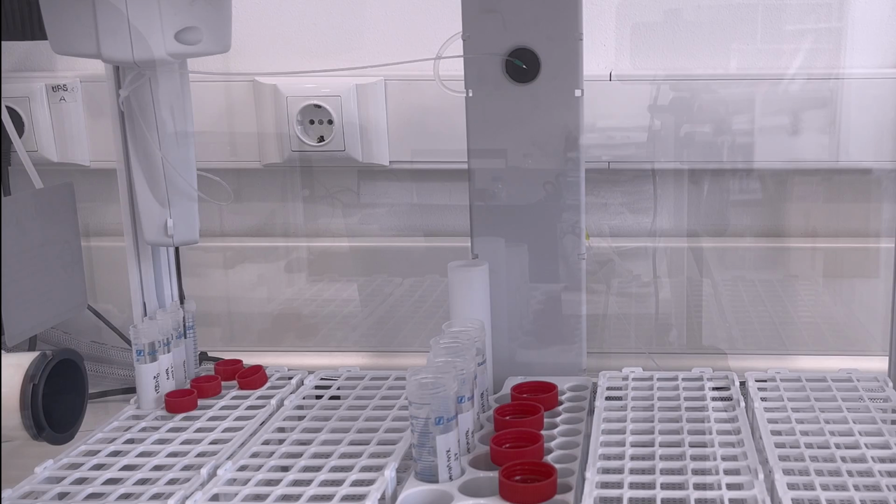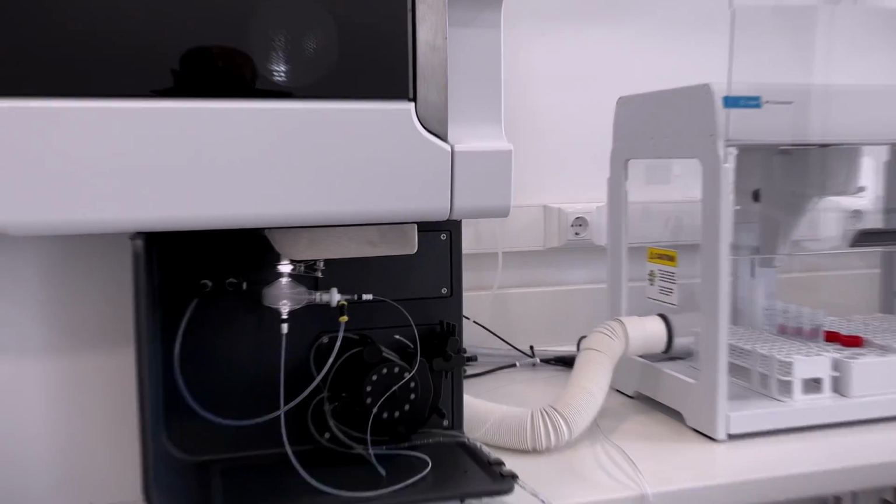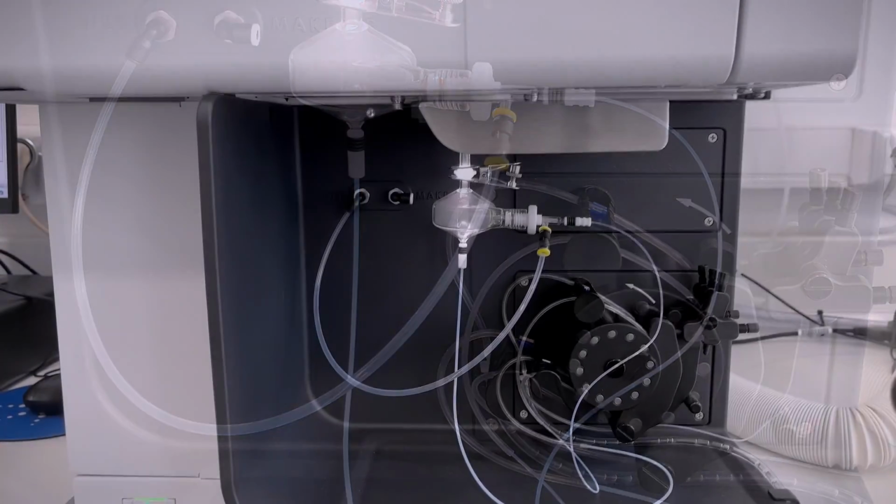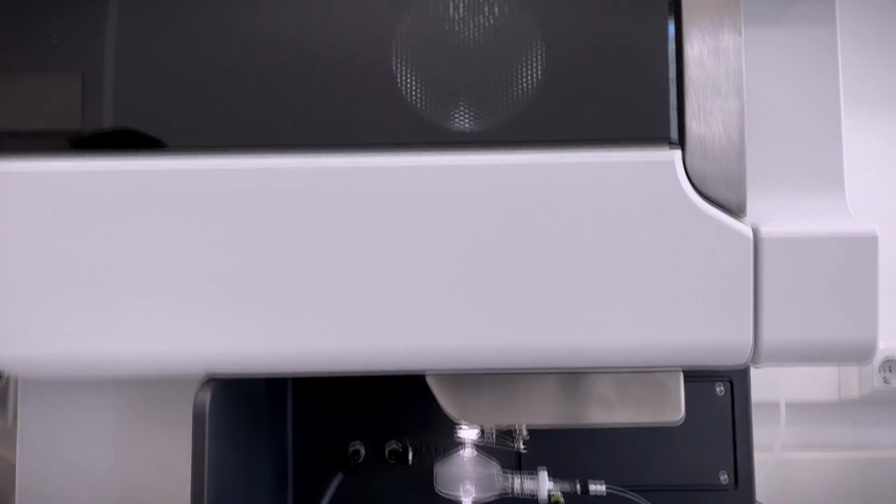After forming some standard solutions and drawing calibration curves before each testing day, the liquid simulants are evaporated in plasma environment and the metals which migrated from the packaging material are quantified.